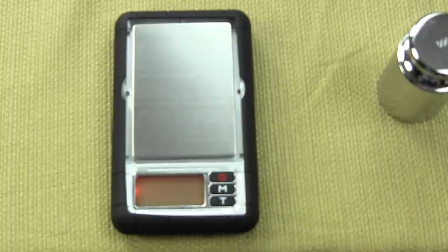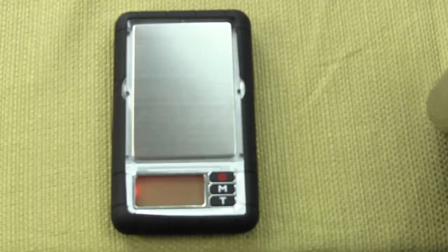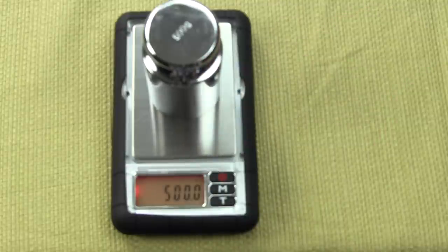The scale will now show the required calibration weight. The calibration weight is optional, so you have to have your own 500 gram weight for this Dura scale 600. Place the 500 gram weight on the scale.